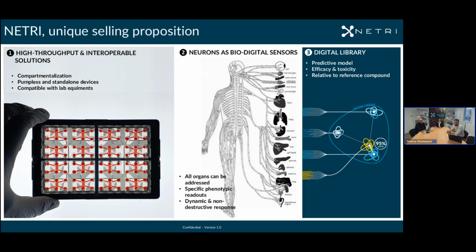Number one, it is transparent, so characterization, for example through imaging, is a very good advantage here. The second thing PDMS adds to our device is the ability to naturally exchange gas between the outside and the inside of the material. That means the cells can breathe when they are inoculated and during the cell culture. As a consequence, no pump is needed. There are no tubes in our devices.